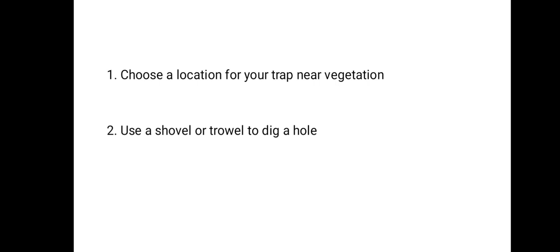And how deep will this hole be? It mustn't necessarily be too deep. Maybe between 20 to 30 cm is okay for such insects. The hole will be a little deeper, up to between 20 to 30 cm, so that trapped insects that fall into such holes will not be able to crawl out so easily.